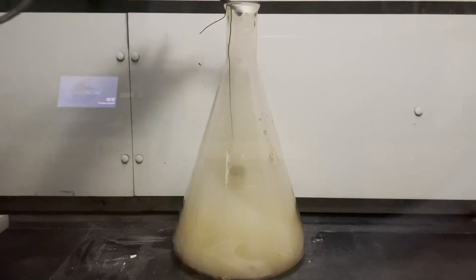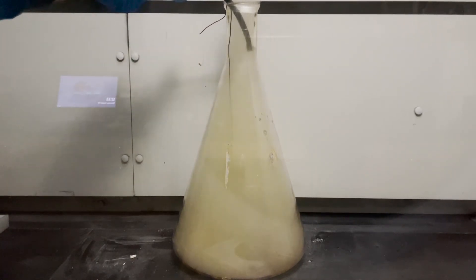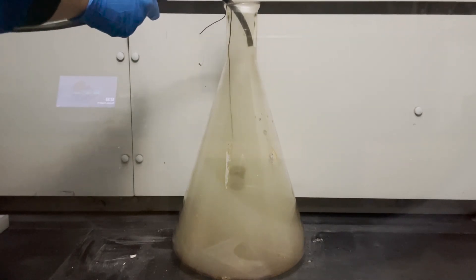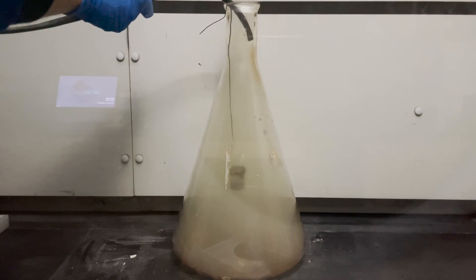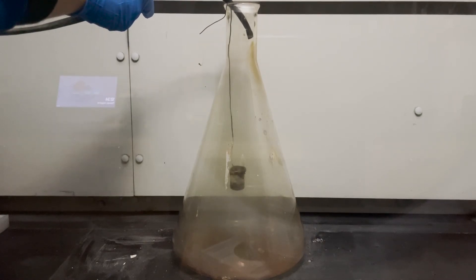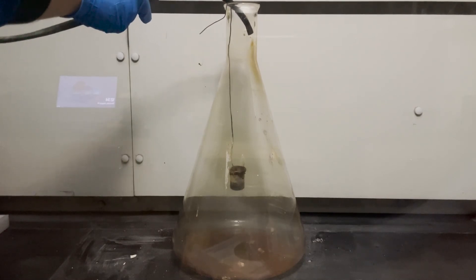Once the reaction is over, I clear out the flask using compressed air. This actually ends up getting rid of most of the sodium chloride that I've synthesized. There isn't much left in the beaker except for some sludge.